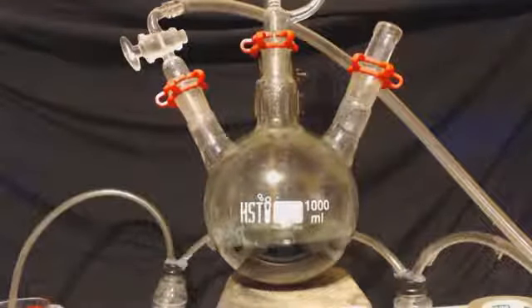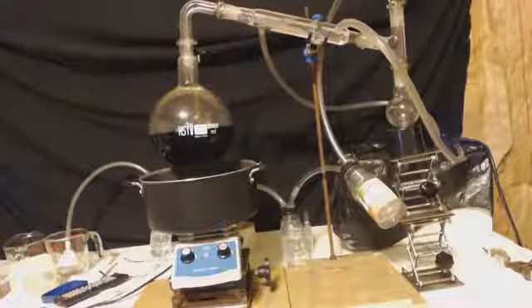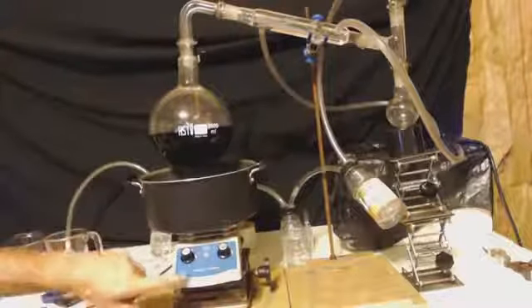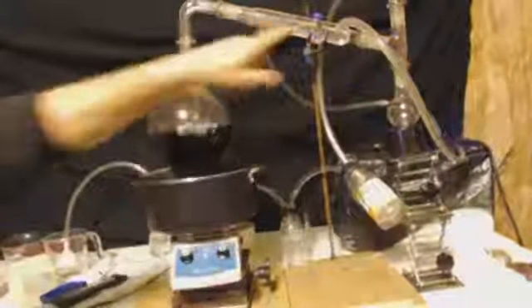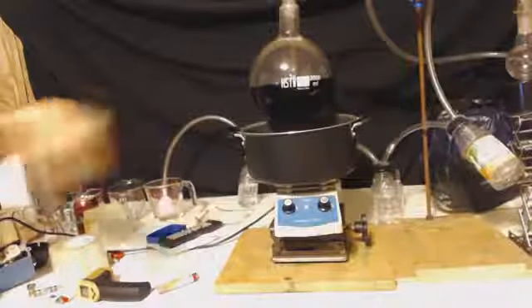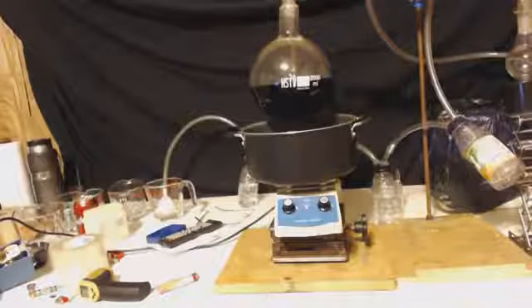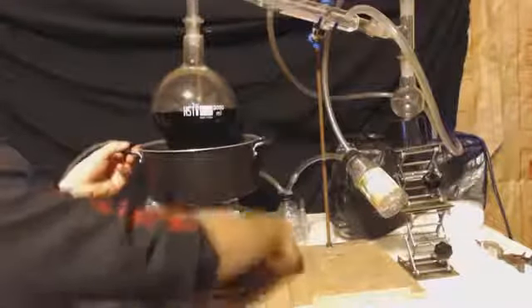Remember how I said I cleaned out the pieces that got foam on them when it overflowed? I cleaned those pieces out with water, and that water I added to the pot. And here I put it all in that round bottom flask to the left. You can see I have my heating water bath. It's a simple distillation. And up on top, I'm not even distilling water. I'm distilling dilute HCl. So the HCl is going to go through my bubbler there and get scrubbed and come out just air and hydrogen. So I'm going to raise my mantle and heat it up. I actually had to redo this whole thing on the stove because I needed the flame to get the water hot enough.